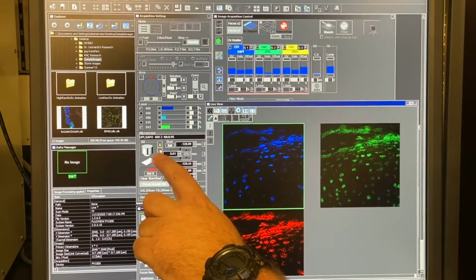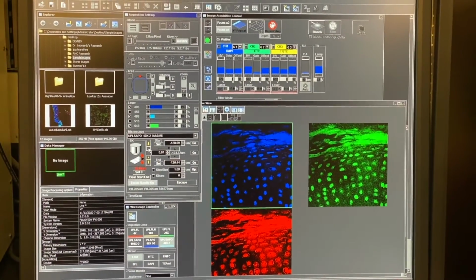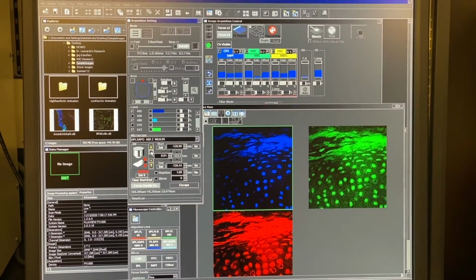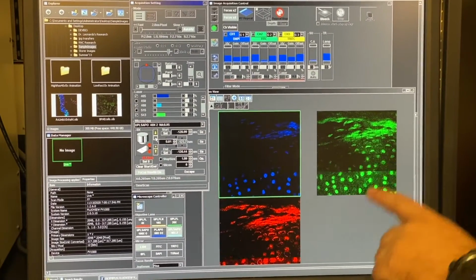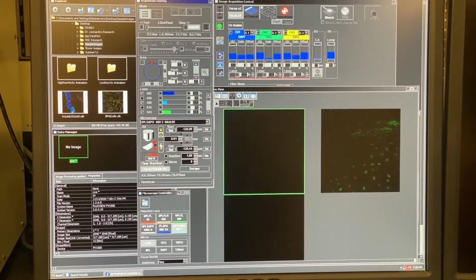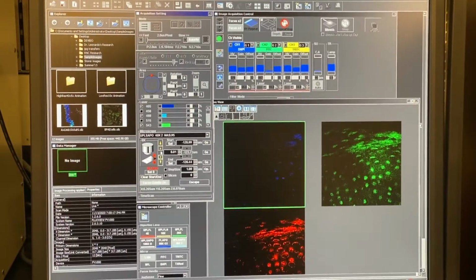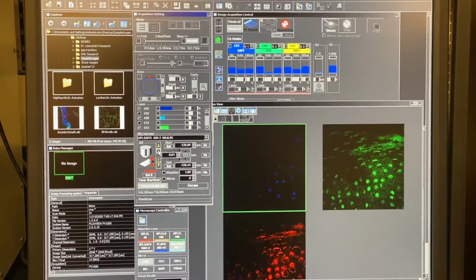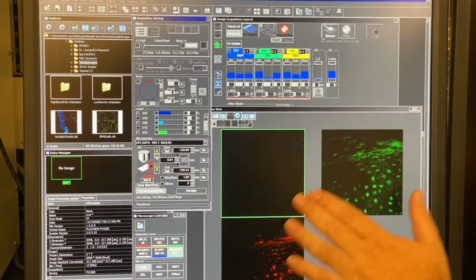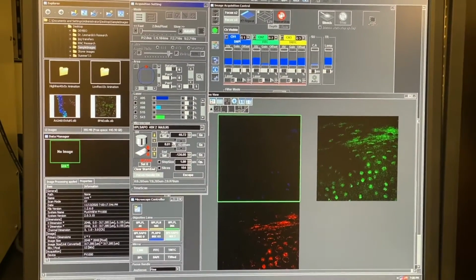And now I'm going to click. Let's move up towards the top. So I'm moving the stage such that now I'm focusing on the very top of these cells. Oh, look, I'm losing all the staining. I've gone too far. Let's go back down some. Okay, so I'm in the tissue section here. This first tissue section will barely have any blue in it. I'm going to go ahead and set that as our start point.